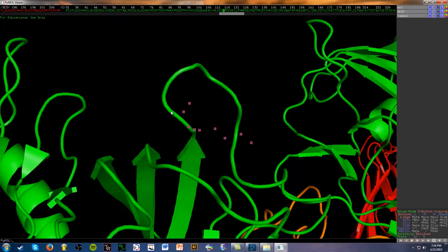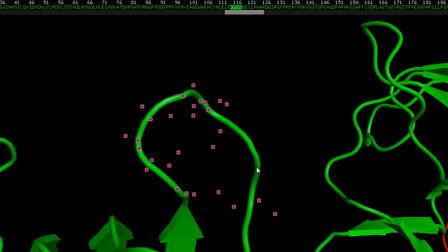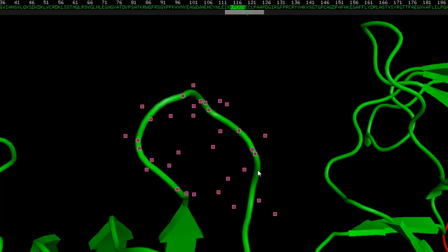So first what I'd like to do is just start selecting the residues around this area. We're just going to click to select, and as you can see, as I'm clicking through, the sequence is being highlighted.